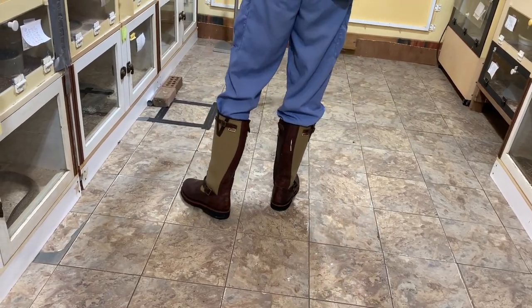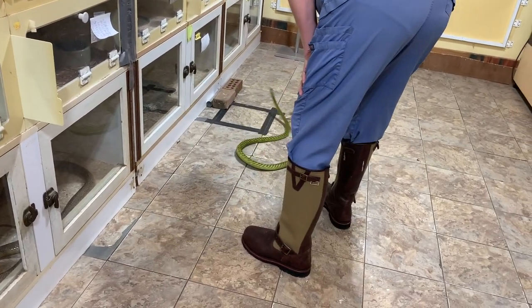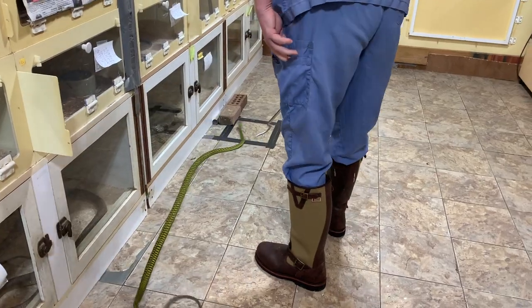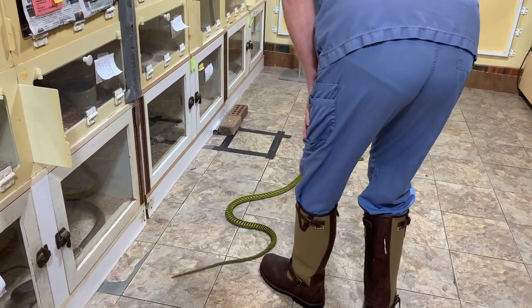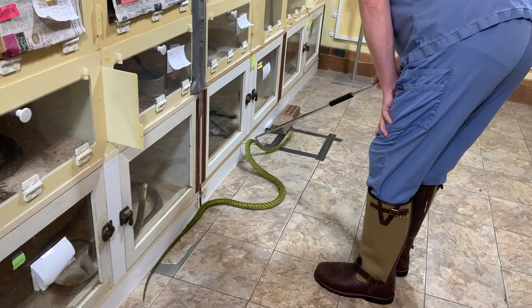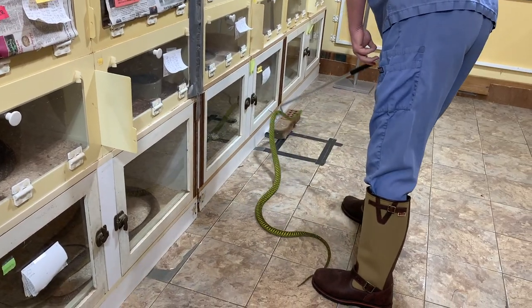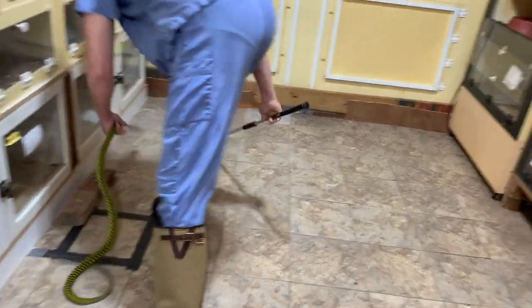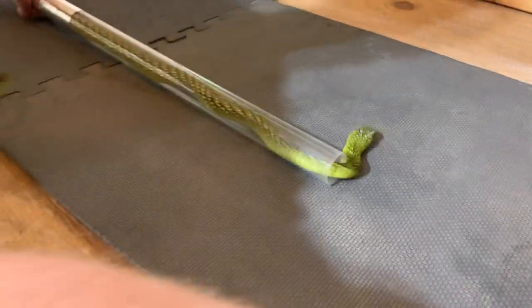I think some people might edit this part out where it seems like it's taking forever and the snake isn't cooperating, but this is the reality — snakes do not always do what you want. The snake doesn't understand what we want; we can't just ask it nicely to give some venom. This is the safest way for the snake. You have to have empathy for the animal and understand they're just reacting to what they think is best. As long as you're patient and gentle and wait it out, eventually you'll get to what you want.